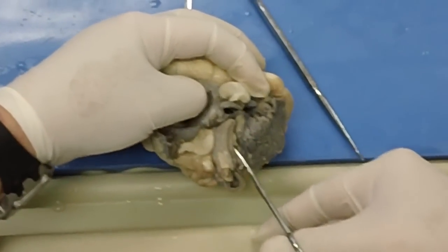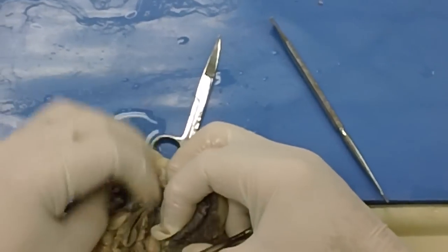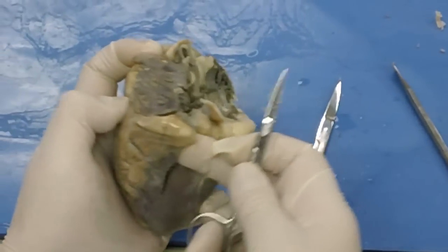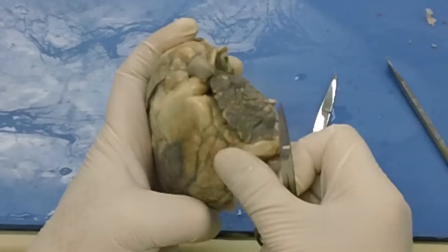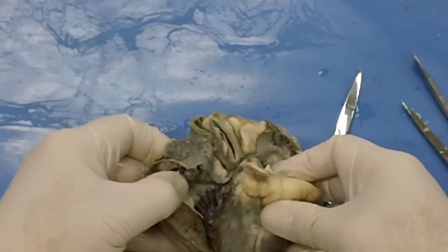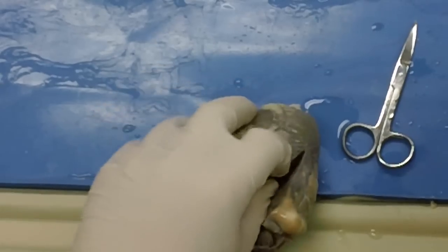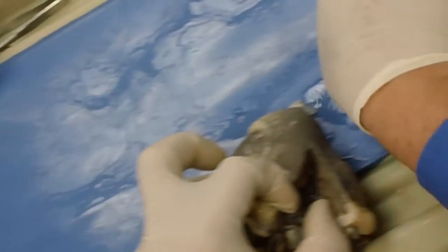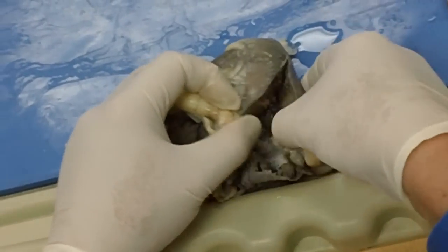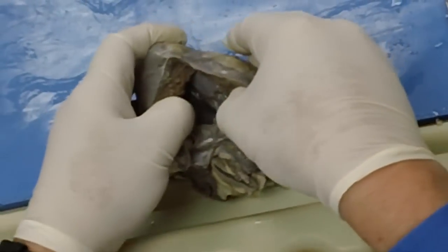Slippery little devil. Okay, so we're in the left ventricle there. Now we're going to try to go right out through the aorta. Let me see if I can open that just a little bit more. Okay.